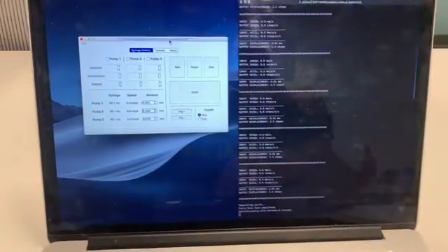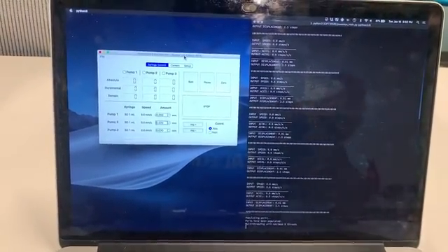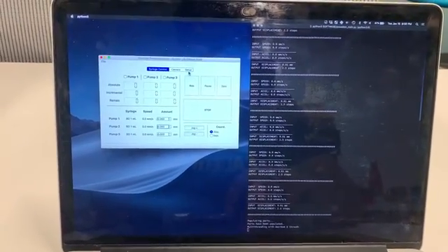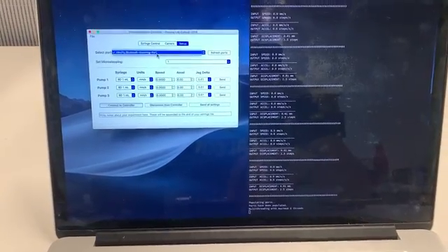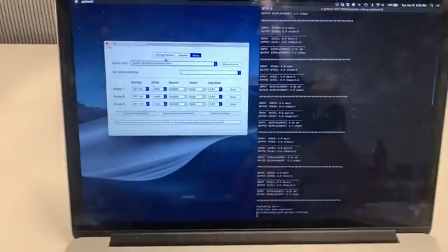Once we install the software, we can run the GUI through either the command line or by double-clicking the executable file. First we'll go to Setup and look at the port — we can see that my port isn't available; the one I connected to just shows a Bluetooth port.